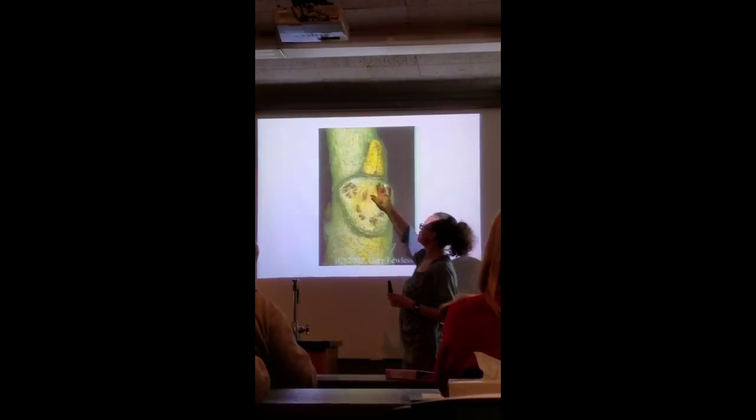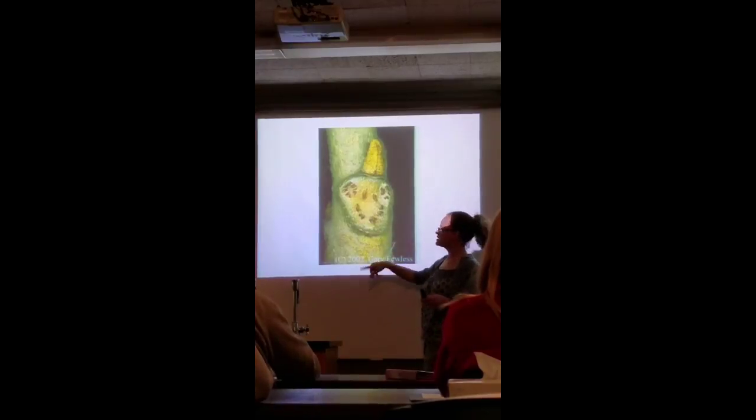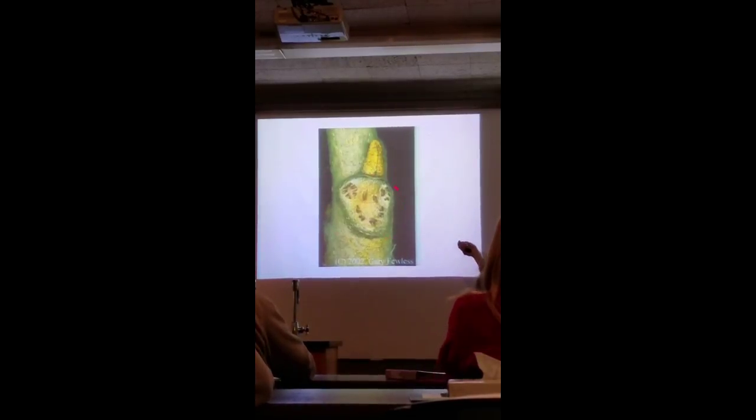What is this whole structure right here called? The leaf scar. Leaf scar, and then these individual dots are the bundle scars, where the veins were. This right here is the axillary bud. If I said what region is this, you'd say the node. A node is where a leaf attaches to the stem.